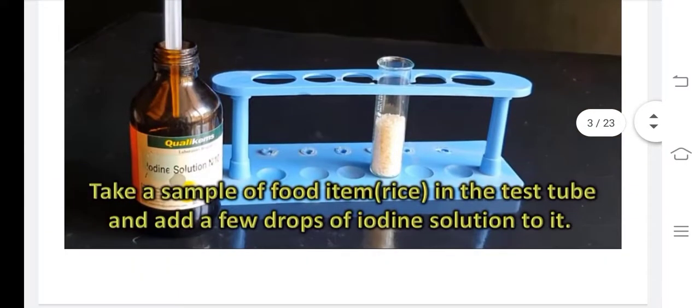Let us consider. In order to check that starch, what we have to do? Take a sample of food item. Without that, we can't do that. What is the procedure, children, we are doing? Observe carefully this. Take a sample of food item or rice in the test tube. Why have they taken rice? Because rice is a carbohydrate. So what do they have to do?